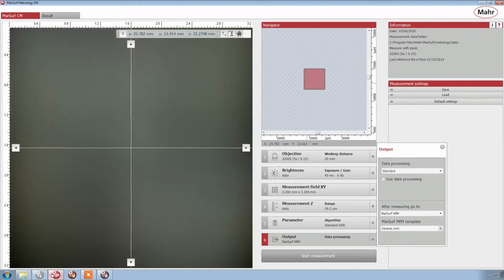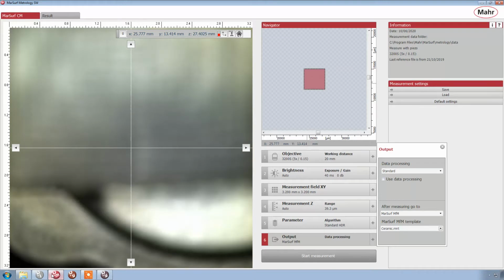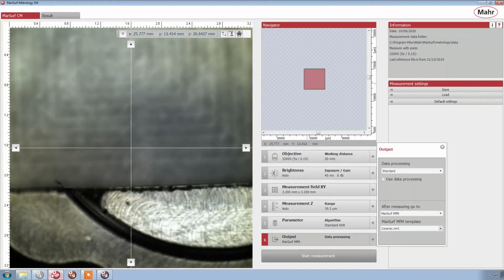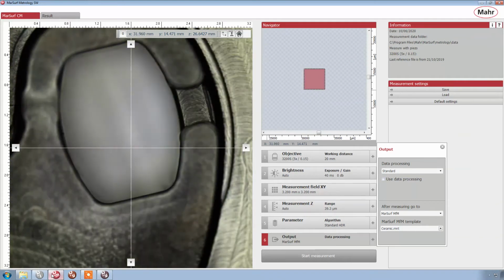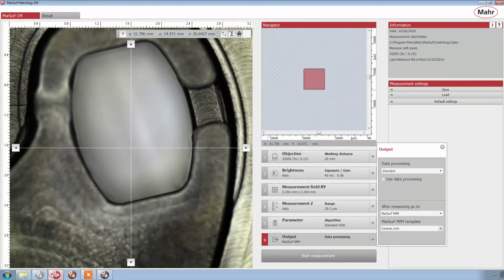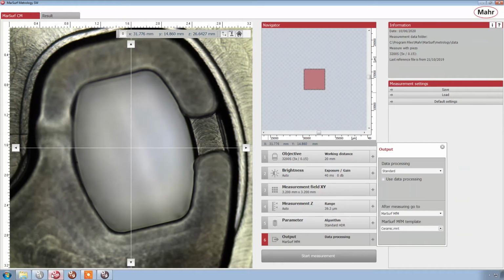And again, with this part, it's a transparent plastic, injection molded part. It's something that I'm always asked: can you measure polymers? Can you measure plastics? Okay, but can you measure clear plastics? I always answer a bit flippantly, yeah, of course, obviously we can do that. I guess it's just because the tool does it so well, I don't realize that it can be problematic.